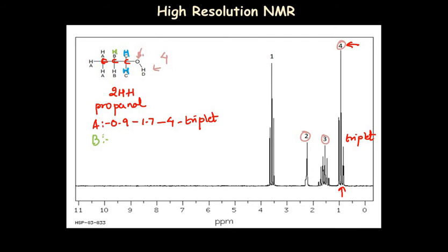Now this proton is having again a methyl group, so again it should be produced somewhere near 0.9 to 1.7 ppm itself, but this hydrogen has 2 carbons besides it, which are having 3 protons and 2 protons on each side.